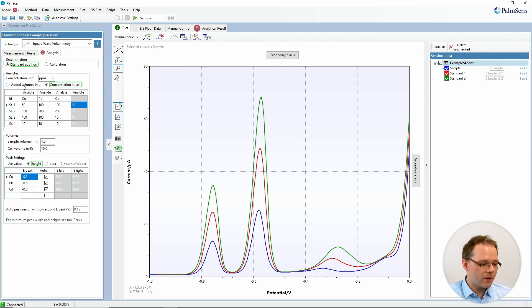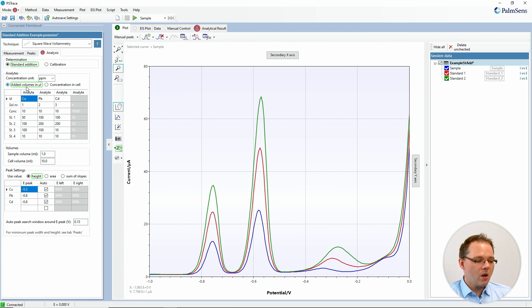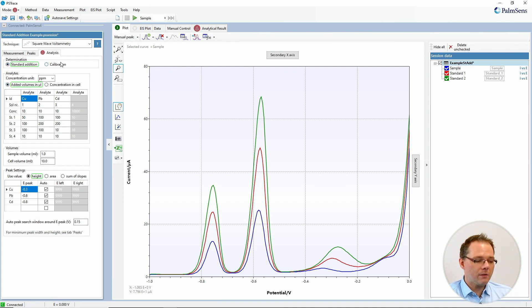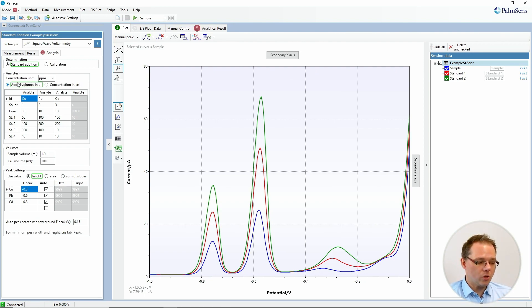The other option is to tell the software how many microliters of standard solution you have added to your system. The usual combinations are: with the standard addition method you use added volumes in microliters, and with a calibration curve you most likely use concentration in cell, because then you have standard solutions with fixed concentrations. For standard addition you have an unknown concentration and you add known volumes.